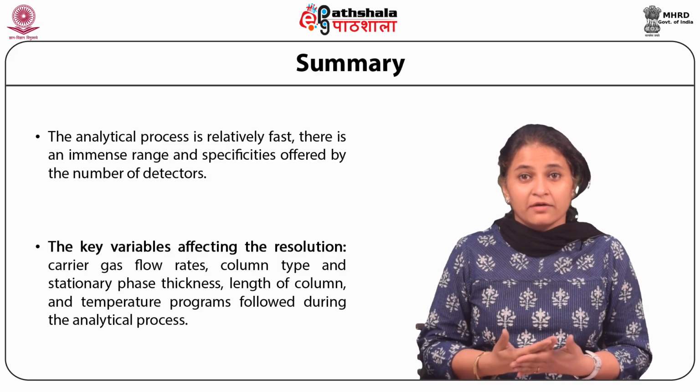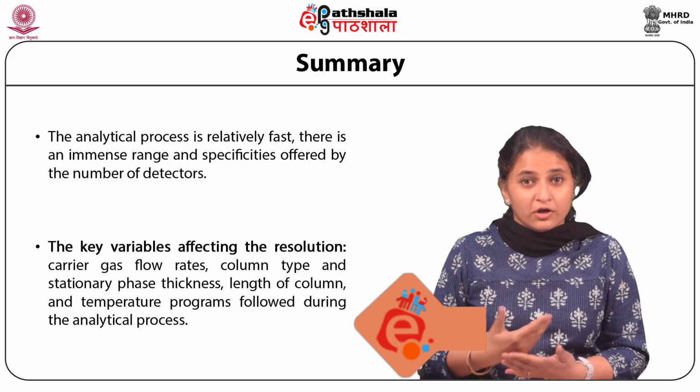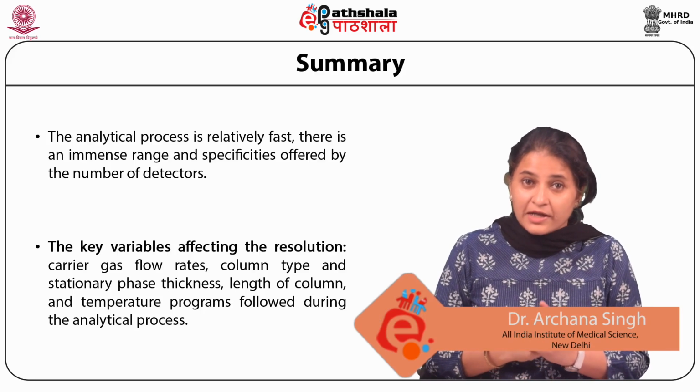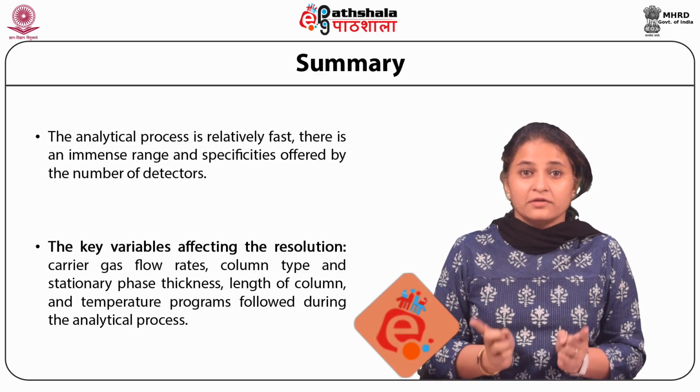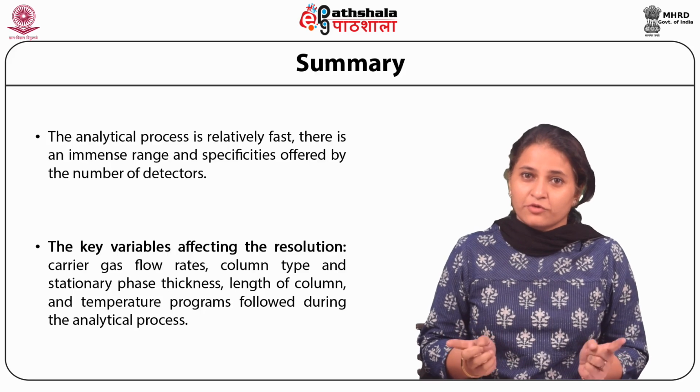These variables are the flow rates of the carrier gas, the type of column being used, the thickness of the stationary phase, the length of the column, and the temperature programs that are followed during the analytical process.